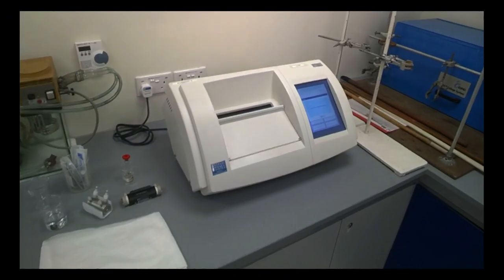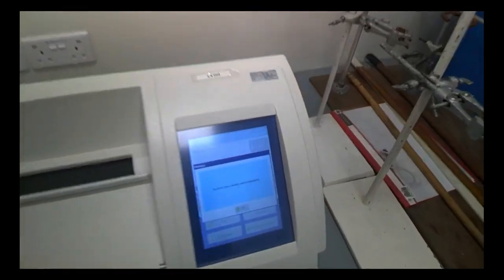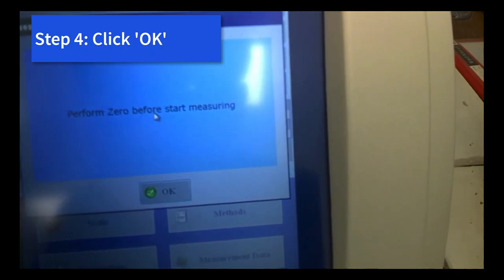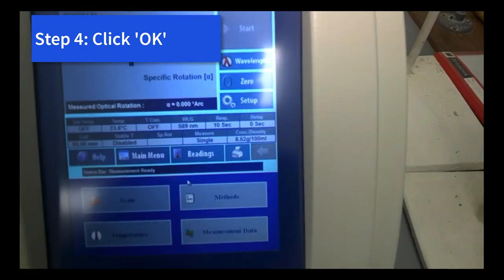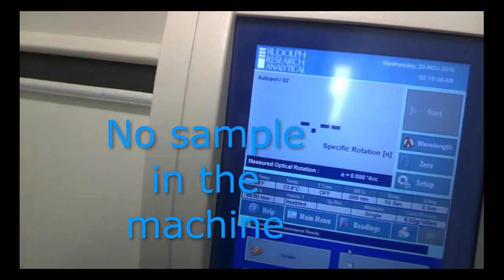Okay, so guys, now we are back. The machine has warmed up, we can start the experiment. So you see on the screen it says here that you've got to perform zero before measurements. We click OK, and see the panel here. The start button is now in gray, you can't click first because there's no sample inside the machine.